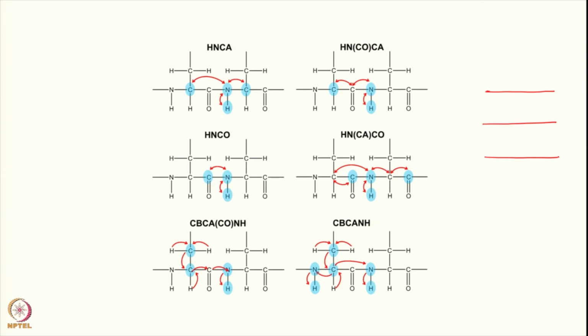So you need to be able to apply pulses along the 3 different channels. Okay. So you apply various pulses there, and finally you actually collect the data only on the proton channel. In between, the magnetization flows through different nuclei, which I will explain to you. We take one by one and see how this works.